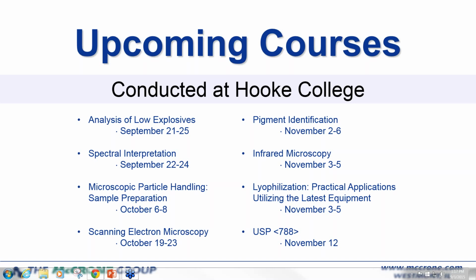Okay, thanks, Kate. I think it's also important to point out about the ATR technique is that it's basically recording a spectrum of the material that's in contact with the crystal, and because of that it's primarily obtaining data from the surface of your sample. And so if your sample, for example, is like the one that Andrea talked about with a coating, you want to be sure that you're obtaining spectra from each layer if you have a multi-layered sample. So that's one important thing to keep in mind when you're considering doing ATR work.